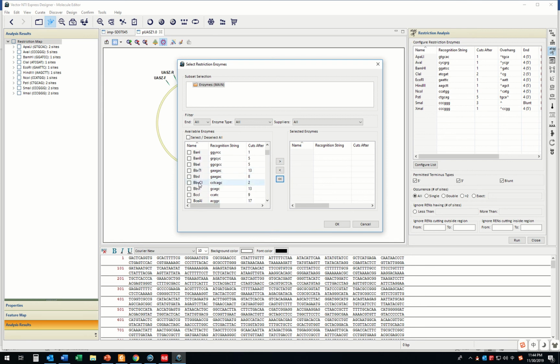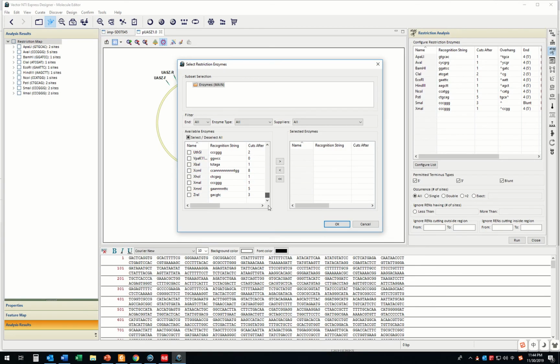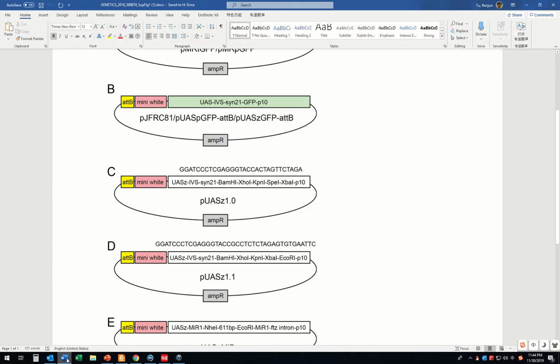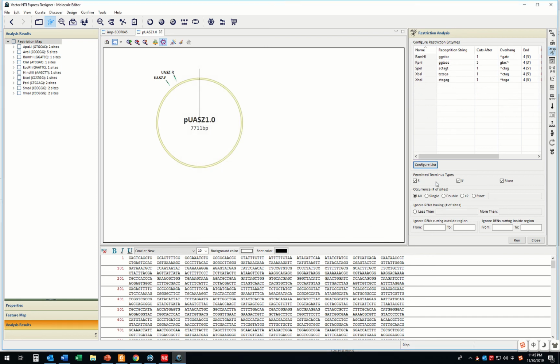The first is BamHI, XhoI, KpnI, and SpeI, XbaI. Okay, put them here, and run.